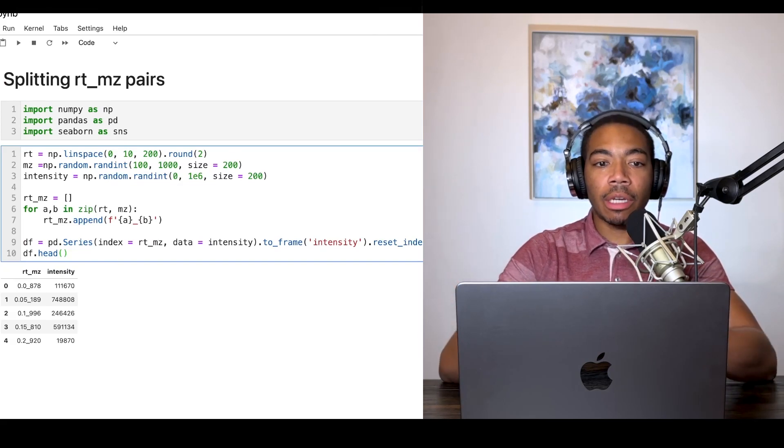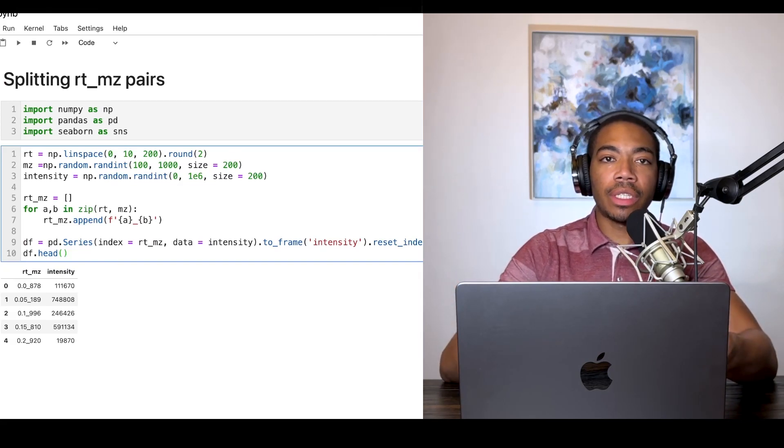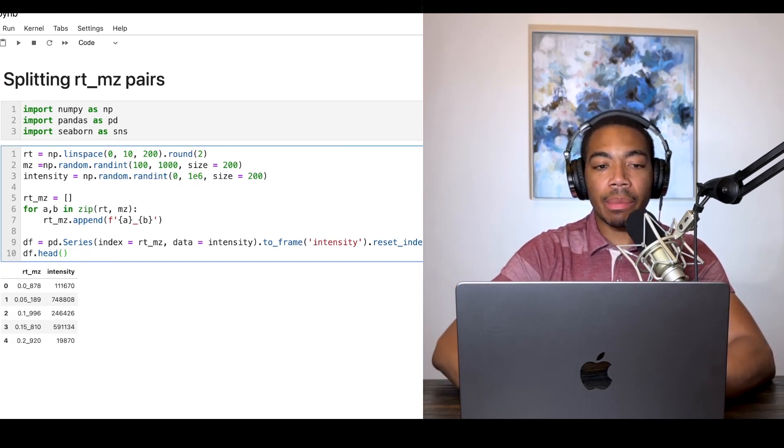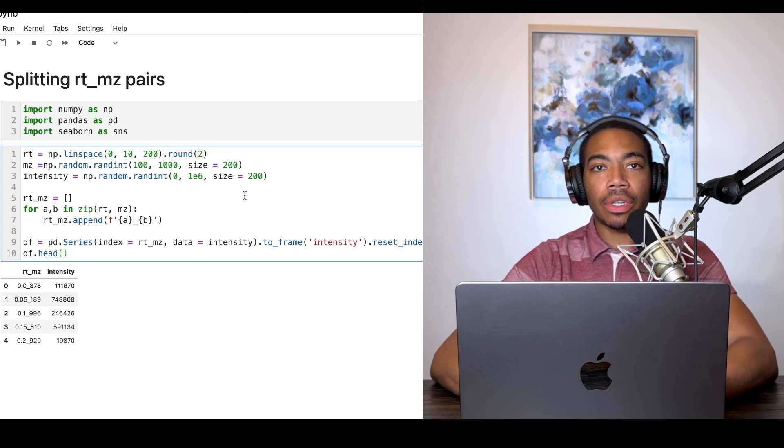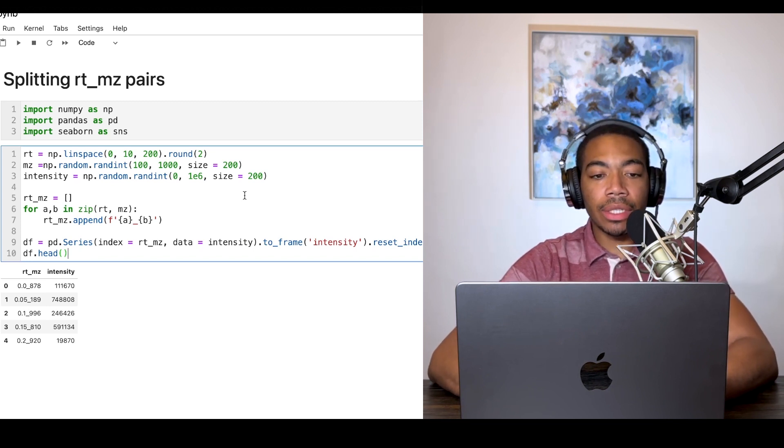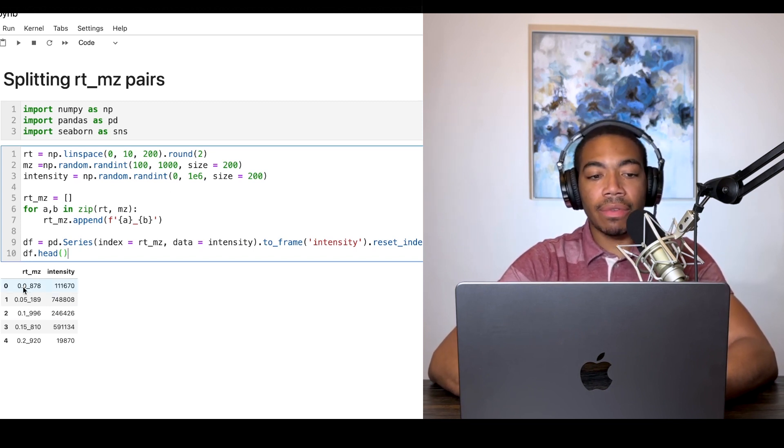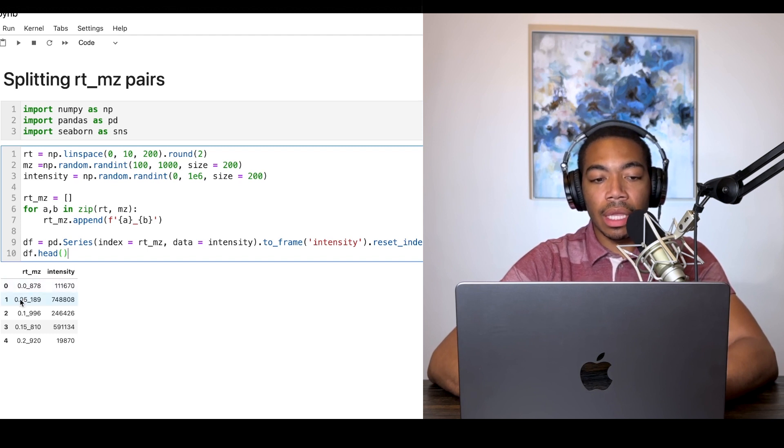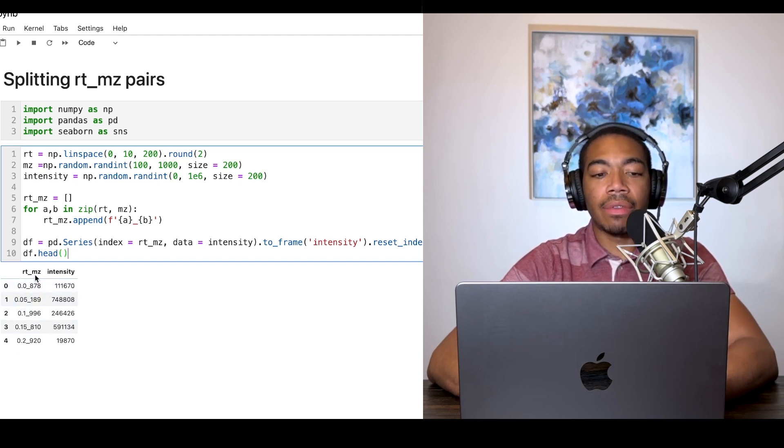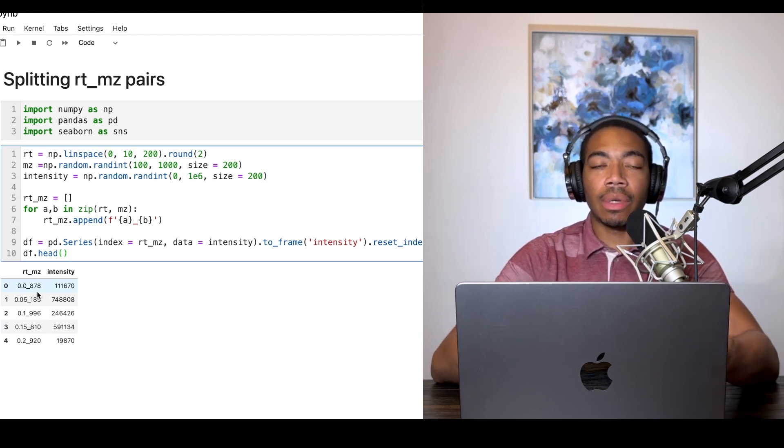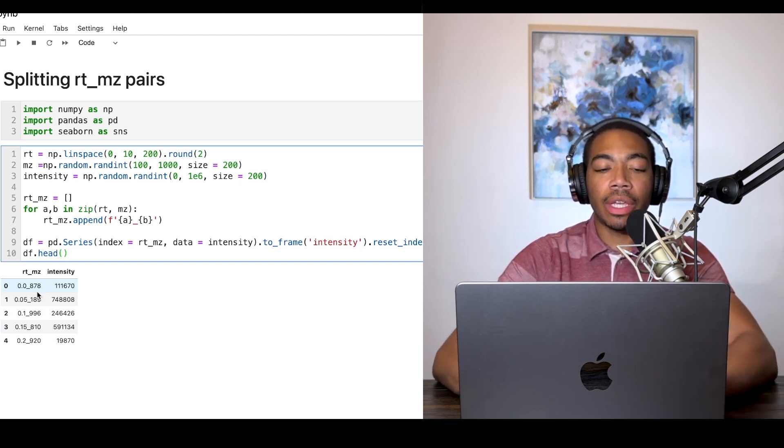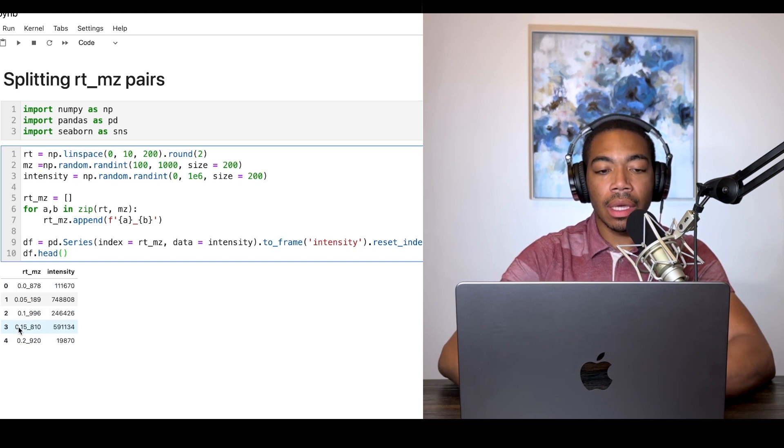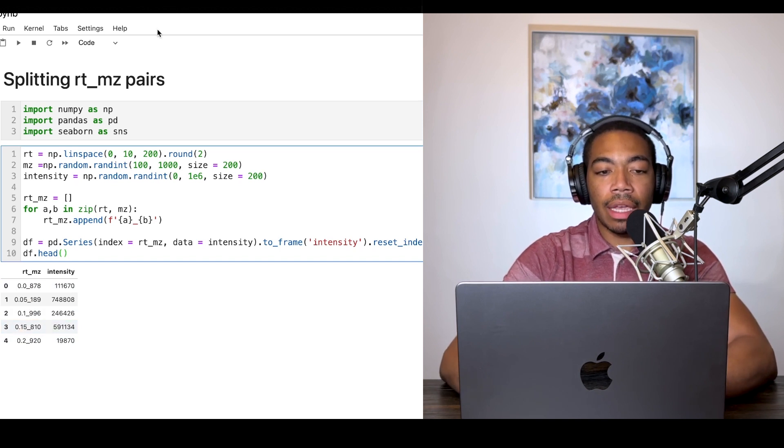Welcome back to the channel. In today's video we're going to talk about splitting retention time and m/z pairs. This is a common data structure in LC-MS experimentation where we have two variables stored as a single column. Before the underscore we have retention time, and after the underscore we have mass-to-charge. This could be analogous to other cases where you have two variables stored as a single column.